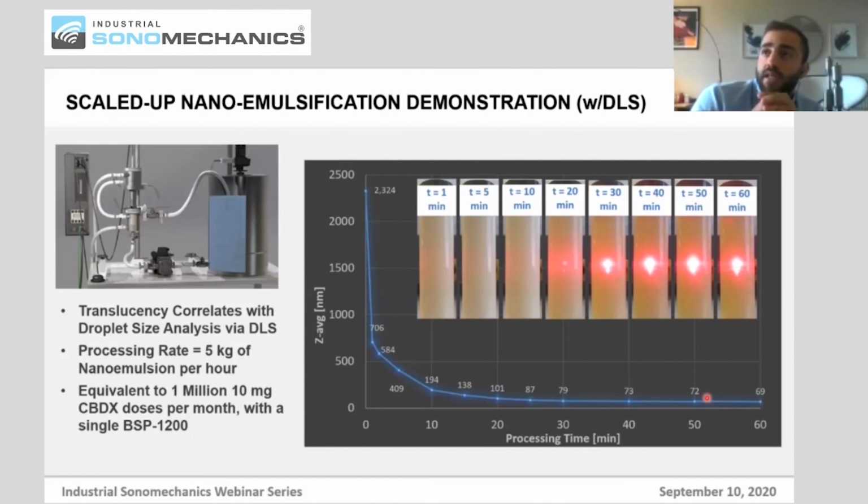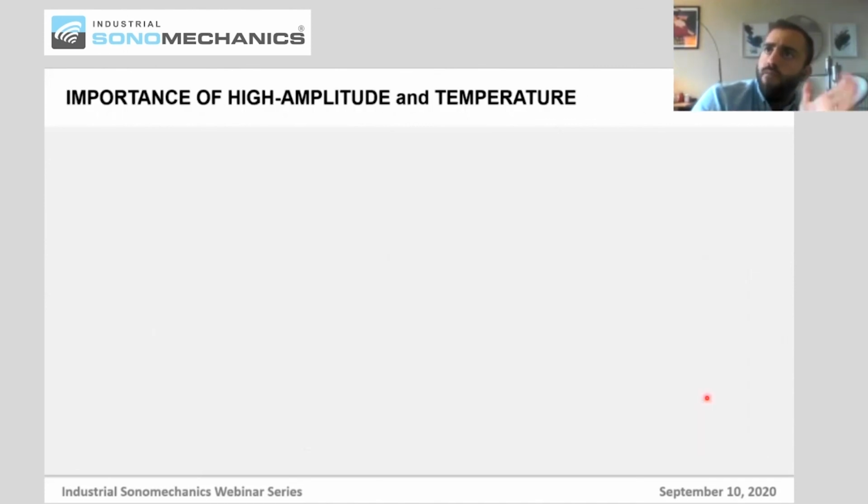So this demonstrates that this process of nanoemulsification is scalable and could be brought to a commercial application. So before we finish up our webinar today, I just wanted to touch upon processing parameters and how we can optimize them with particle size analysis.